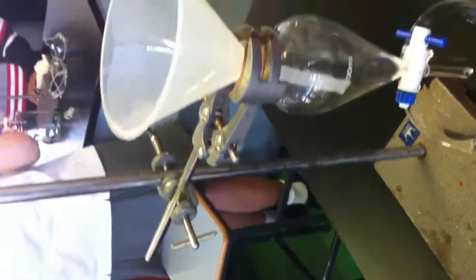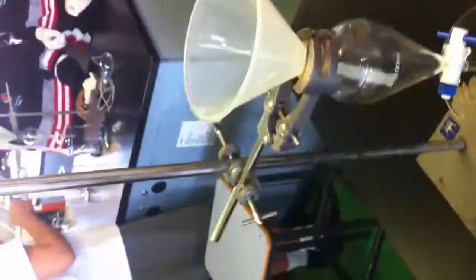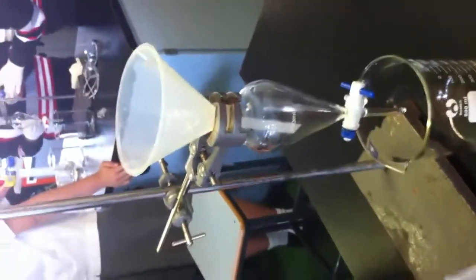Come on. Yeah, okay. Pour the mixture into a... Potions. Oh, right. Sorry, call it potions. Alright, I'll pour this into this beaker. It's going to stink. Wait, that's what it says here. It says, disconnect the flask and then pour about 100 ml of distilled water in here and then decant it into this. Oh, okay. So also, we get a measuring cylinder and put 100 mils in here first. Come on, let's get moving.